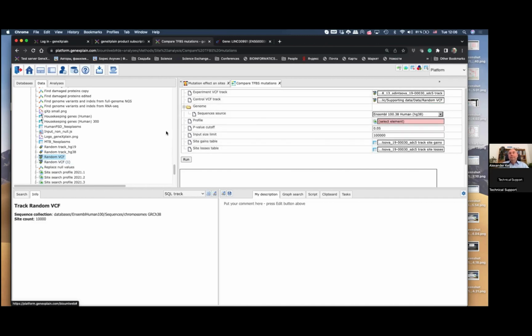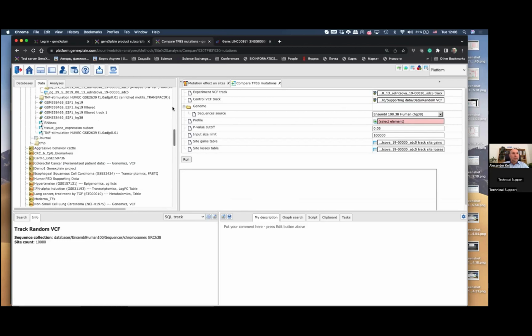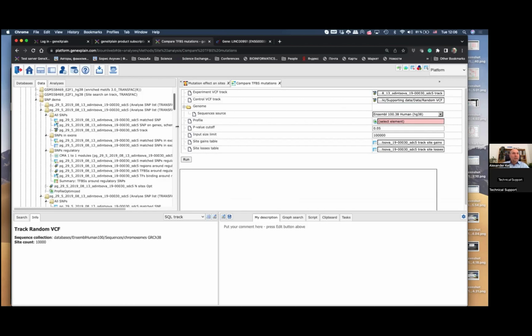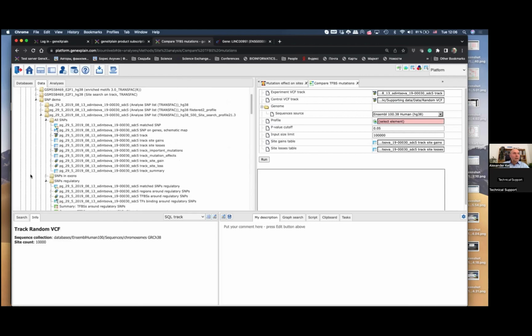Now it has something to compare with, and then it will start to calculate, to find binding sites for each SNP, and also find binding sites in these random SNPs, and then it compares the frequency of found binding sites. It takes some time to do this comparison, but let me show just the final result of that p-value calculation. For that, I will, see, I did it.